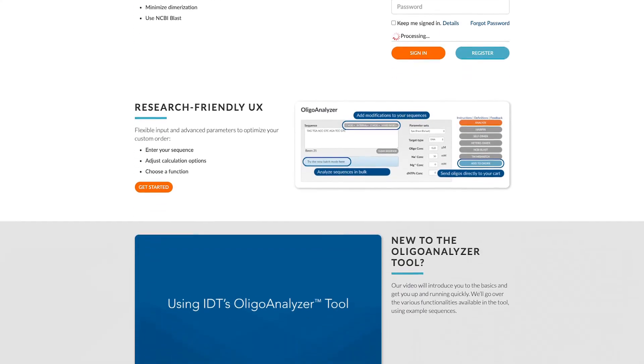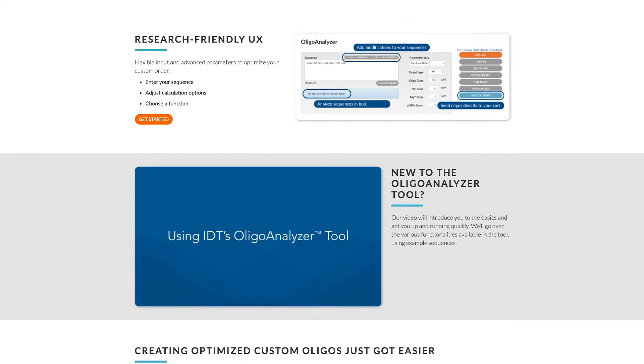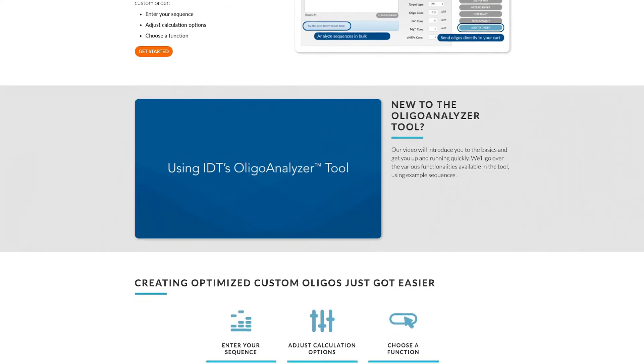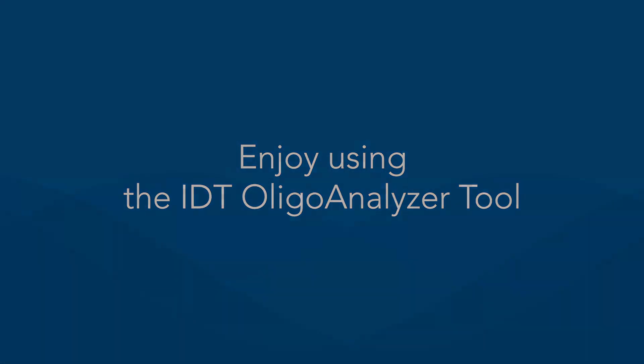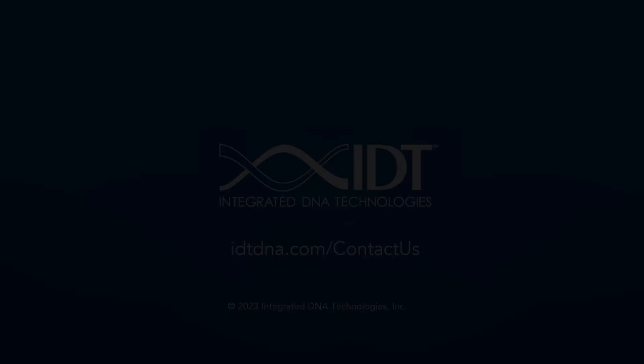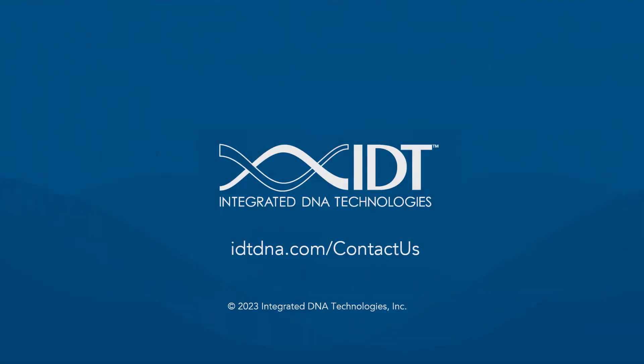We hope this tutorial makes it easier for you to use the IDT Oligo Analyzer to assess your Oligo sequences before ordering them. IDT also offers many other tools to help you design custom sequences. We hope you make use of those tools as well. Let us know if you have any questions. We're here to help you with the Oligo Analyzer tool or any of our online tools.